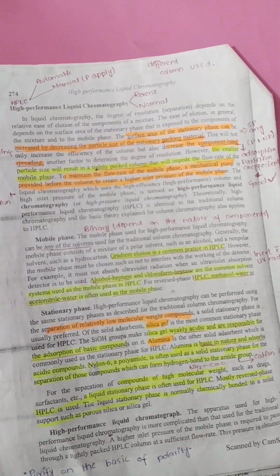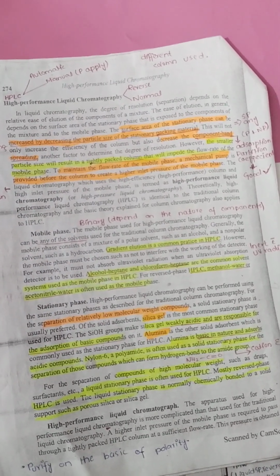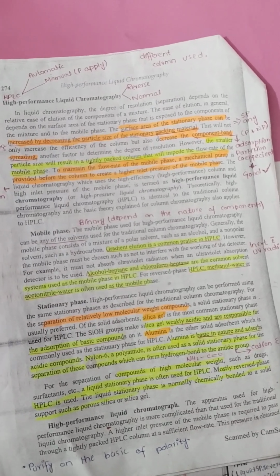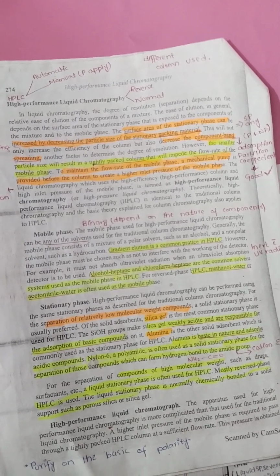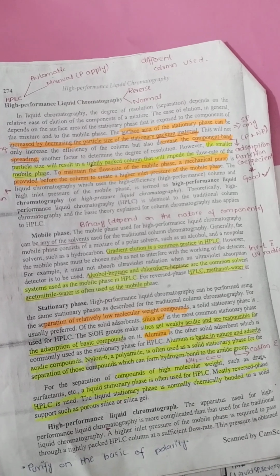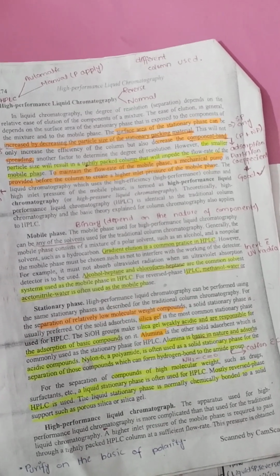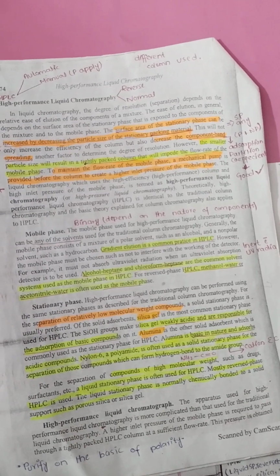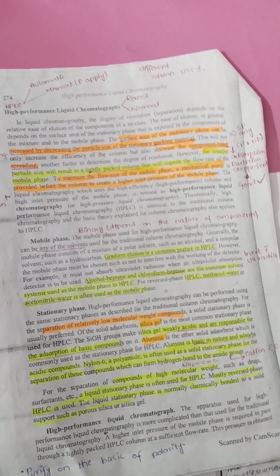That's why we call it high performance liquid chromatography or high pressure liquid chromatography, because we apply pressure, but it is similar to column chromatography. Now we discuss the mobile phase that we use in this technique.